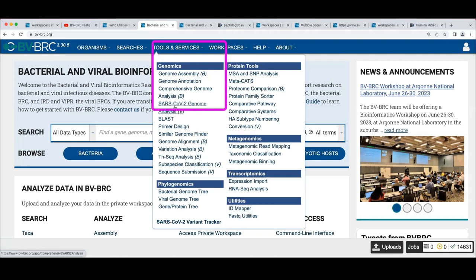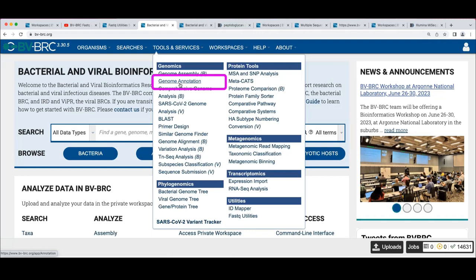That SARS-CoV-2 assembly service is a reference-based assembly. The genome assembly service above is de novo genome assembly, and there's a big difference: with reference-guided assembly for SARS-CoV-2 you're assembling against the Wuhan HU-1 reference genome, essentially tiling. In de novo assembly you're putting pieces together from scratch, which is more appropriate for bacterial assembly unless you have a very closely related reference genome.